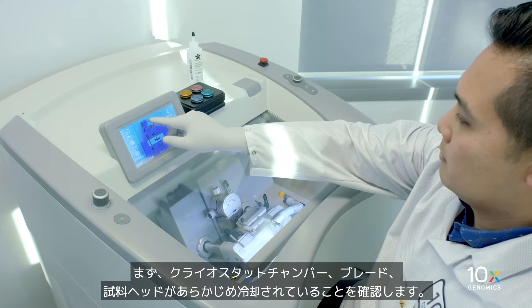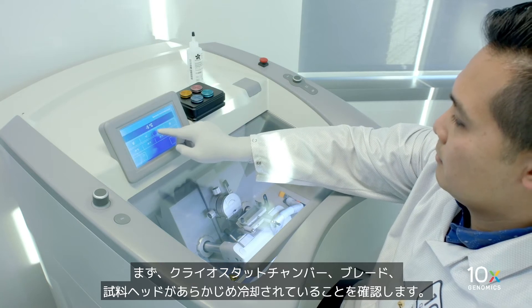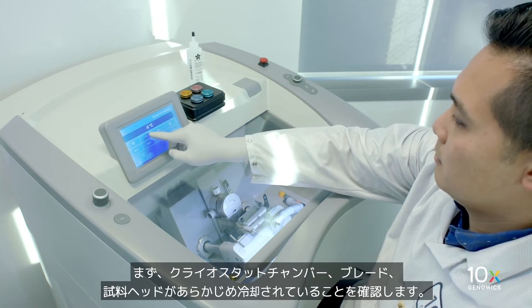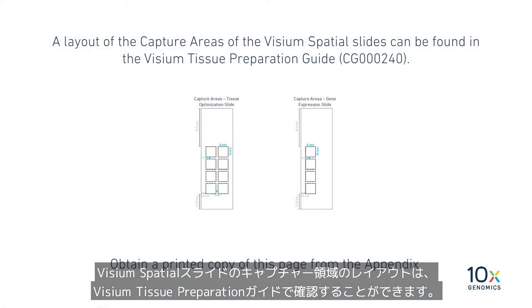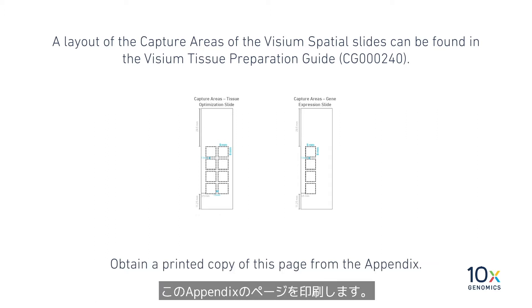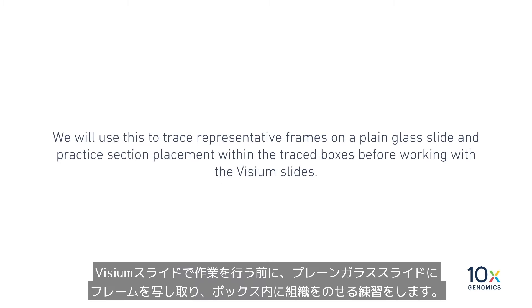We are ready to practice tissue placement on a plain glass slide. First, ensure the cryostat chamber, blade, and specimen head have been pre-cooled. A layout of the capture areas of the Visium spatial slide can be found in the Visium Tissue Preparation Guide. Obtain a printed copy of this page from the appendix. We will use this to trace representative frames on a plain glass slide and practice section placement within the trace boxes before working with the Visium slides.